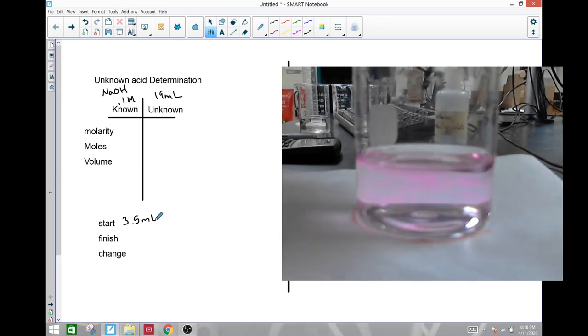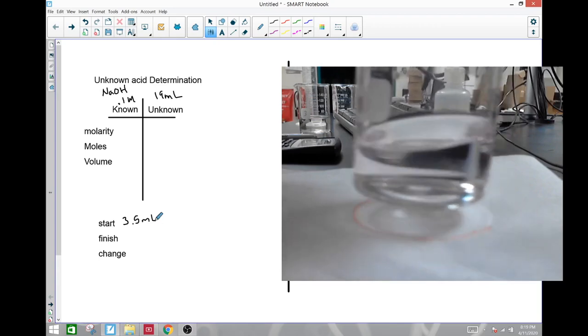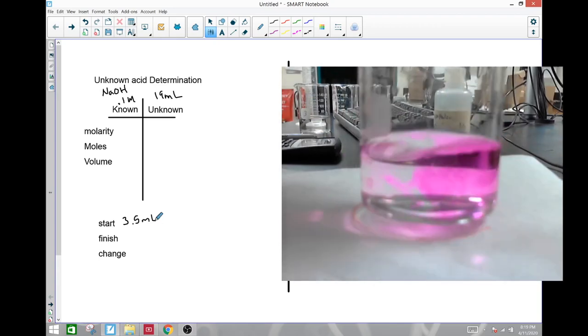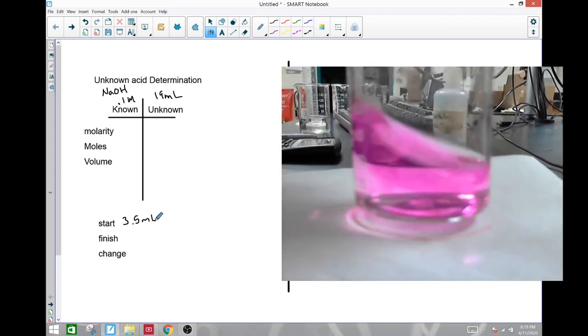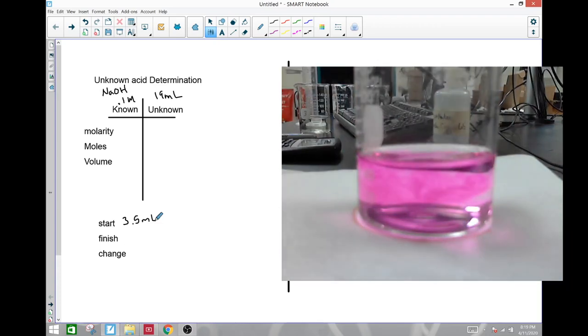And at that point, I would be pretty comfortable with being there, but I'll add a few more drops just to kind of, there we go. And the pink sticks around for quite a while. And my new volume, it may go away eventually, but new volume is going to be 34.0. 34.0. Okay.